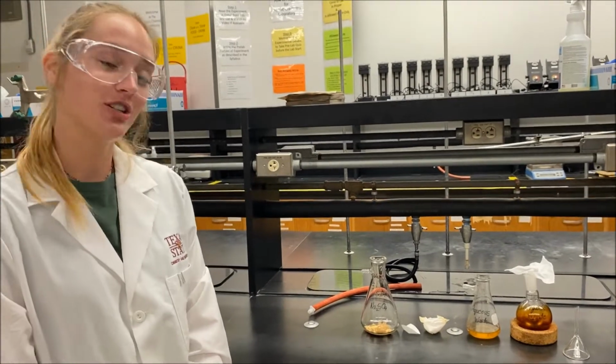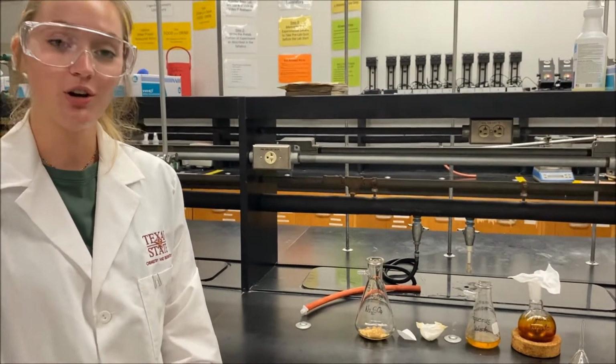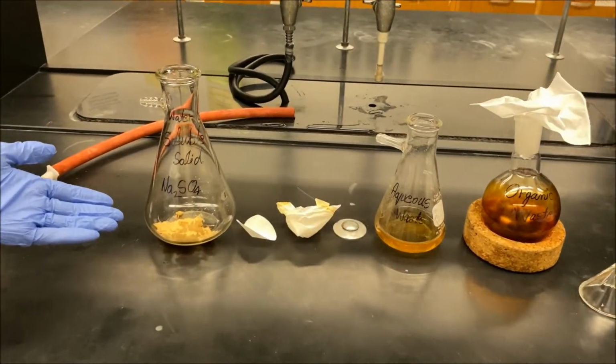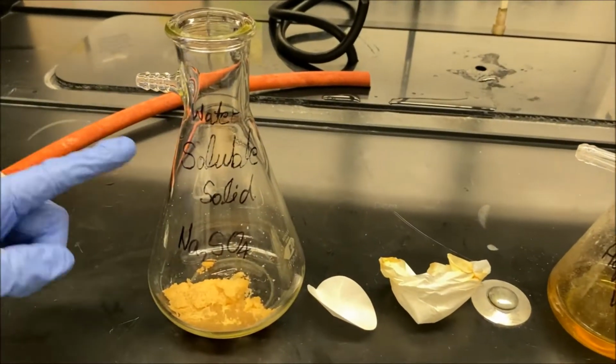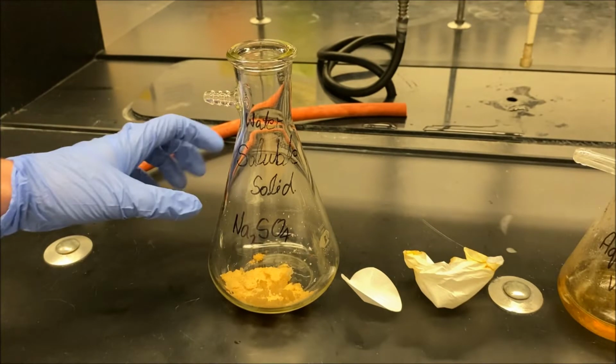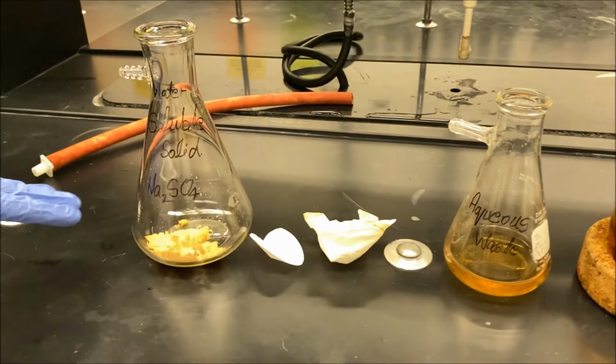So when you finish an experiment and you need to dispose of the waste, you need to know where it goes. So you need to know what is in each container at each time during your experiment. For example, right here we've got some water-soluble waste, which is sodium sulfate. That is in the container, so that'll go in the aqueous waste when you mix it with water.